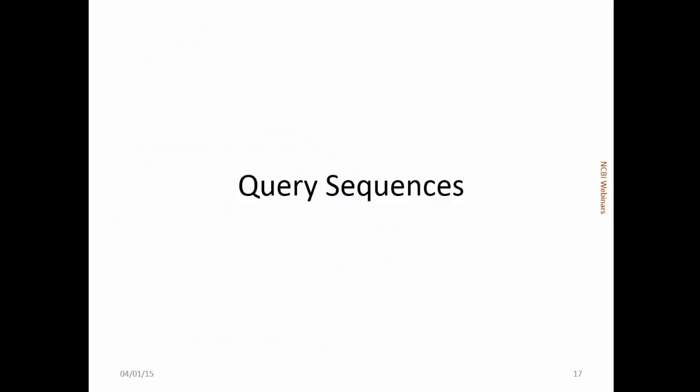So if you're coming to BLAST, the first thing you're going to have to do is come up with a query sequence and input it somehow into the box that's on the BLAST form.